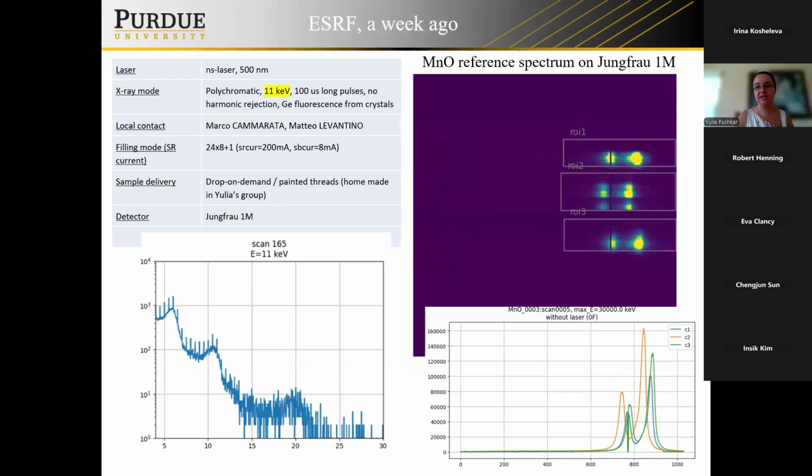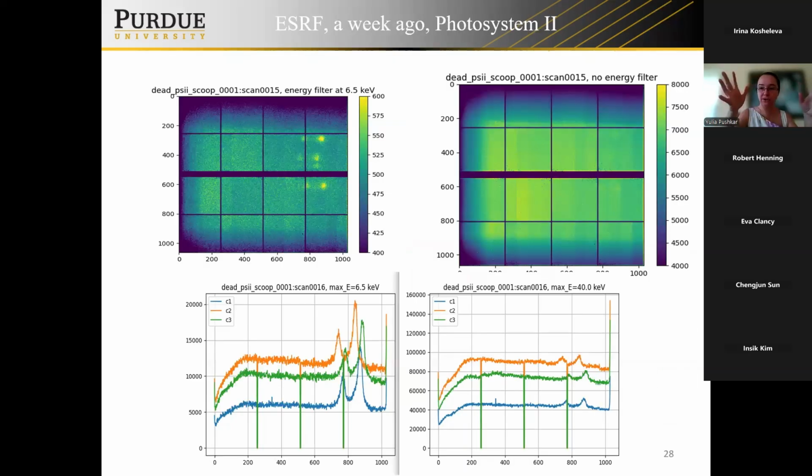Because if you see the box, the back is fully open, so you can still deliver a crystal and shoot diffraction in the back, and nothing prevents you. Maybe you have a little bit of shadowing, we should try.